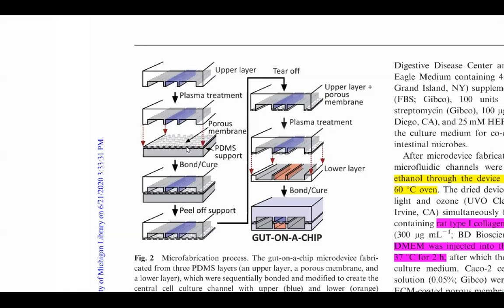They laid this porous membrane over a cured flat silanized PDMS support, and the whole device was cured at 60 degrees Celsius for 12 hours.